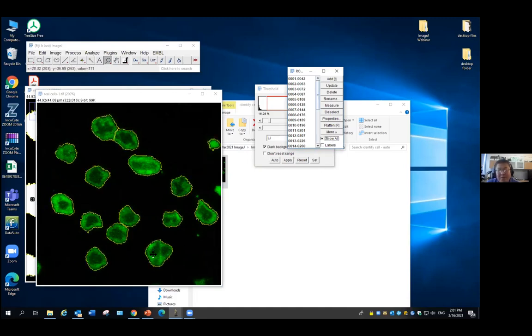And this one may actually be 2 cells, but now it only counts as 1 cell. Again, I'm not really a high-standard guy. If I look at the image and think a clear, simple protocol gives me a reasonable result, I will accept it.